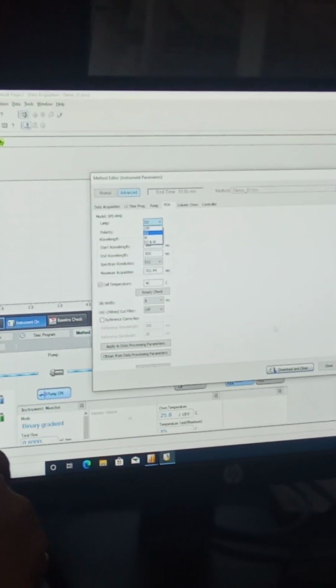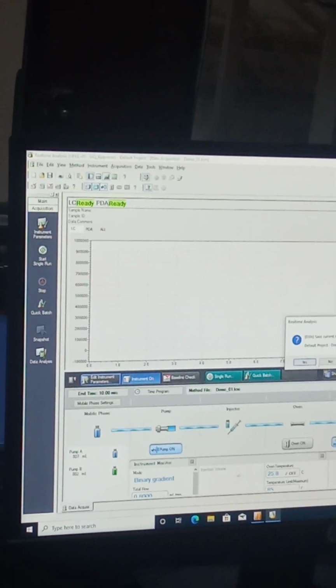Extension 10 minutes also, in case lamp also, some other lamp also. So then you can go and take anything. Edit instrument panel. Yes, open method actually. Open method, then open. You can modify anything. File, open method.